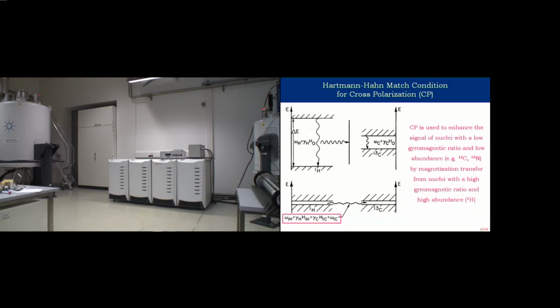It is possible to do this by using the fast alternating B1 field in this system and the same in this system. So we put into the B1 coil, which is constructed with a single coil, two resonance circuits, two frequencies with matched power.